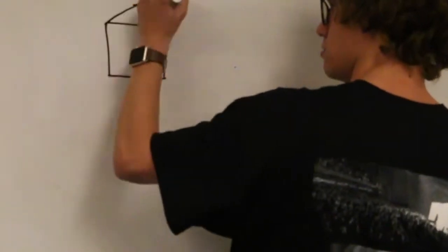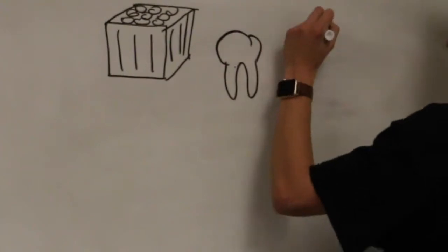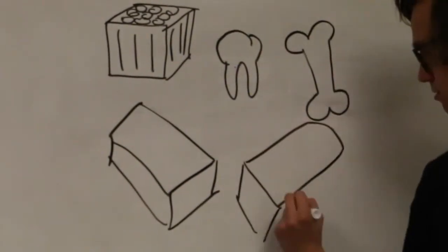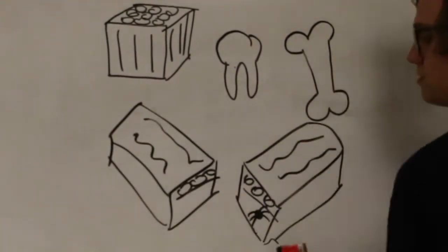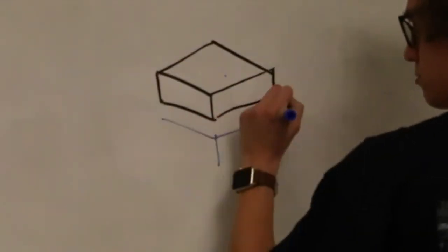Micro-CT is useful for composites to determine volume fractions in pore distributions and biomedical applications. It's used in the food industry to look at things like the distribution of nuts, caramel, and chocolate in a candy bar, or to identify foreign objects in food. Ew! Sadly, there are limitations to X-ray CT.